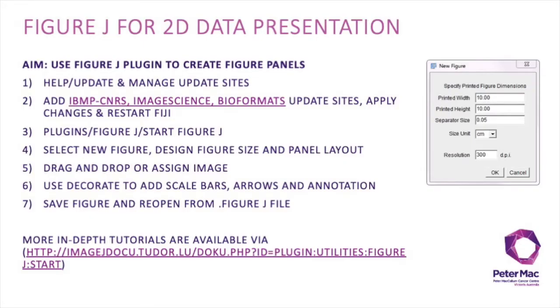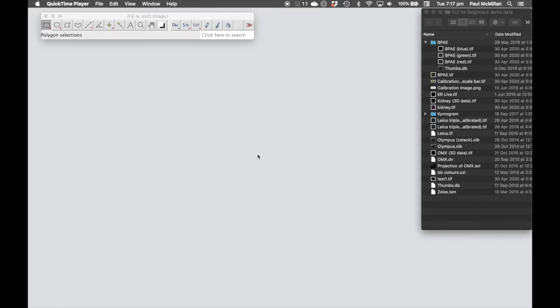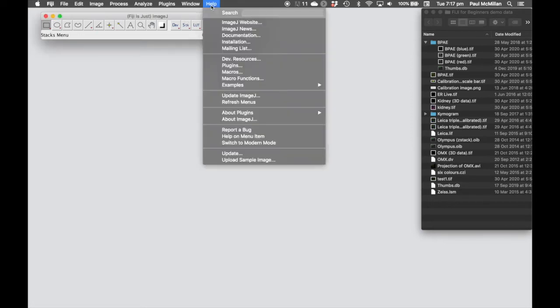Another way of presenting 2D data without making panels manually is to use a plugin within Fiji called FigureJ. To add these plugins, we go to Help, Update.